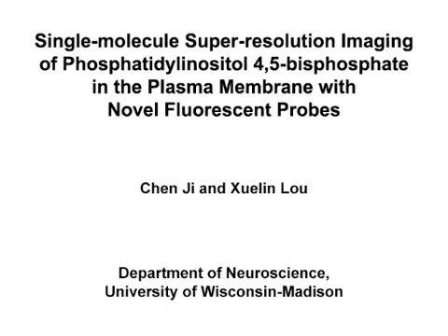The overall goal of this work is to image the nanoscale distribution of phosphatidylinositol 4,5-bisphosphate in the cell plasma membrane using single-molecule fluorescence localization microscopy.